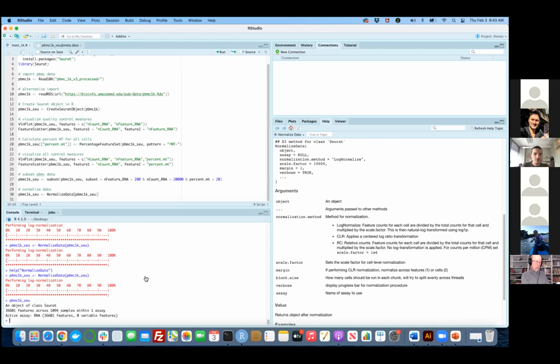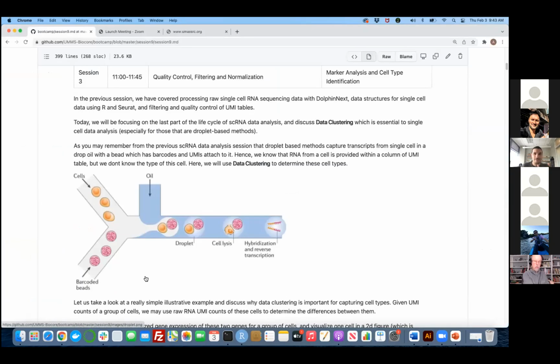So we are going to use really simple machine learning methods in order to divide these mass cell populations into subpopulations and take a look at the expression of each gene in each of these clusters or subpopulations, to understand whether they can be T cells or NK cells or other kinds of cells that you're expecting your biological samples to have.